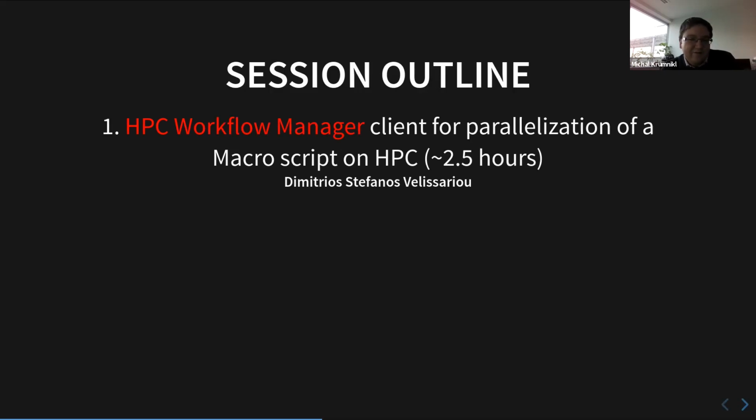So in that first part, we will teach you how to use our plugin for remote execution of macro script on remote supercomputer. So that the macro will not run on your computer, but it will be transferred to the supercomputer and run there. And Vlado, during that time, will show you some hints how to parallelize your code to run efficiently.